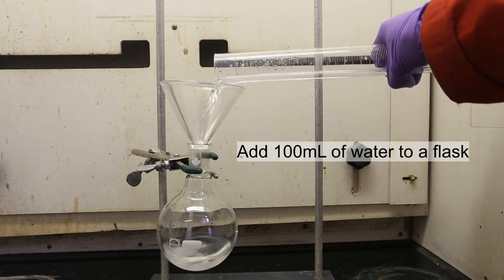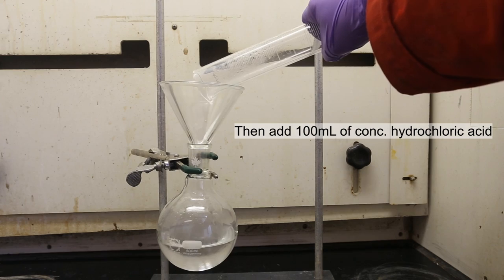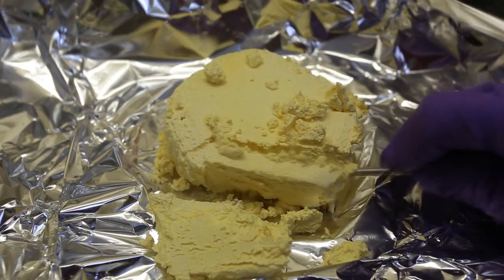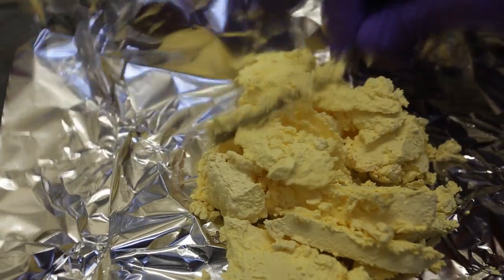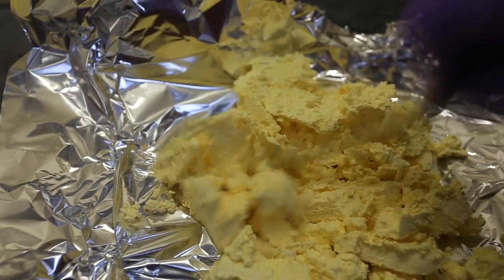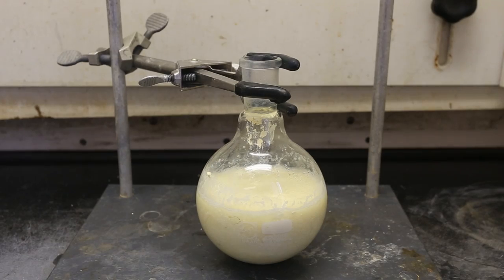First, 100 milliliters of water was added to a round bottom flask. Next, 100 milliliters of hydrochloric acid was added. After the addition of acid, add a couple of boiling chips. The semi-dry, moist product was then chopped up using a spatula. The one benefit of drying this product to completion would be the much easier addition to the round bottom flask. I can tell you for certain that the addition of this moist product to the round bottom flask was extremely unpleasant and messy. This is what my product looked like when added to the round bottom flask.